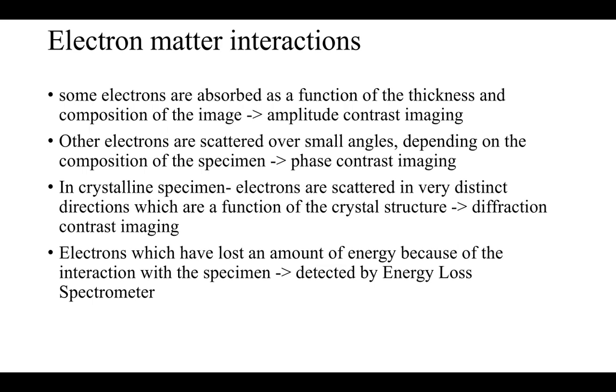Optional objective apertures can be used to enhance the contrast by blocking out high angle diffraction electrons. Now, the outcoming electrons are diffracted everywhere, but if you don't want the highly diffracted ones, you can neglect them and block them, only allowing the electrons within an angle defined by you, and then you can increase the quality or the contrast of this image.